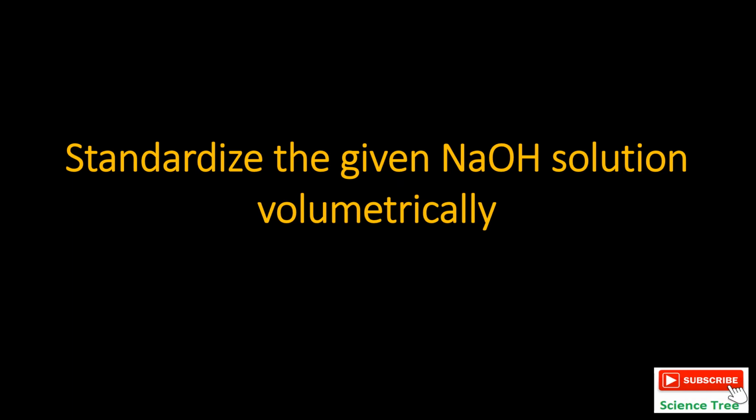We will use the process of titration. Titration is a process in which the molarity of one solution is known and we have to find out the molarity of the other solution with respect to that one. So let's carry out the process, and first of all we will go through the apparatus and the chemicals which we will use to carry out this practical.